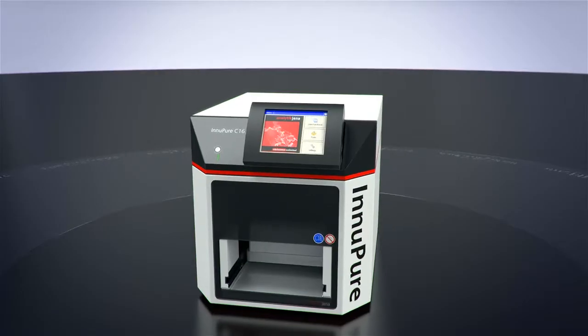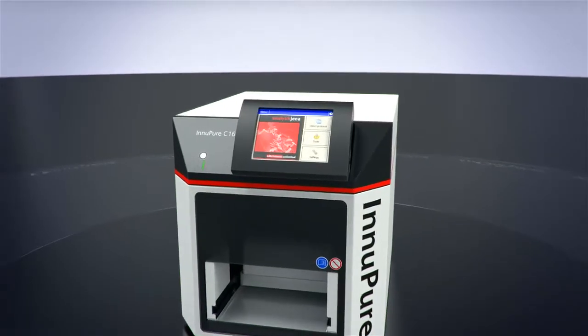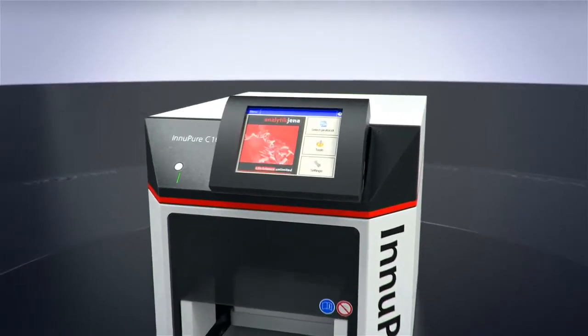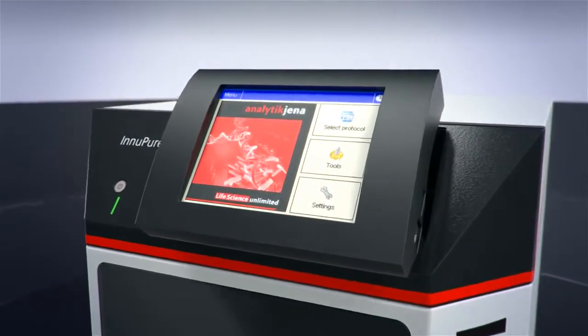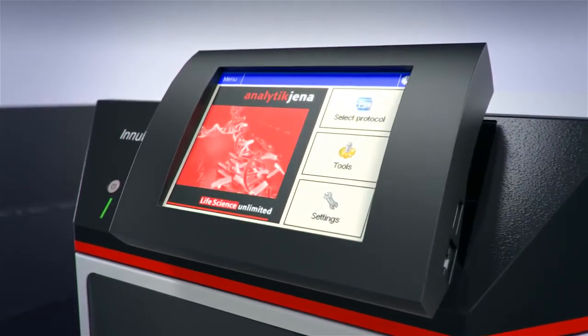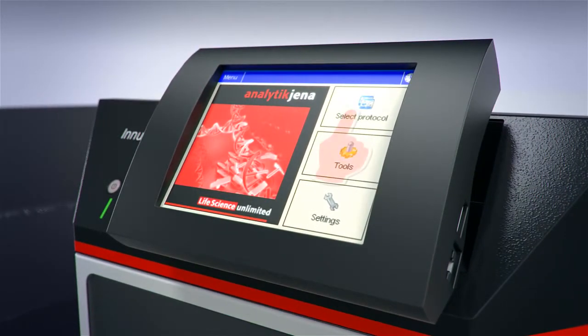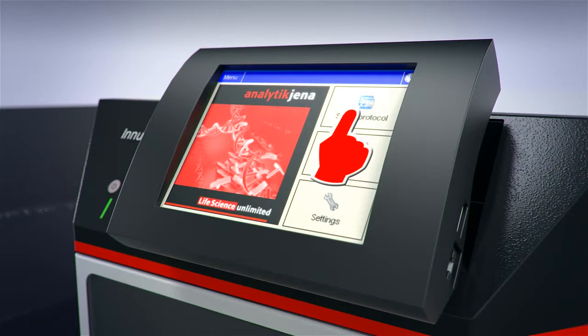In addition to effortless access to a range of indispensable features, the mobile operating unit also provides pre-installed protocols and elution volume adjustment.